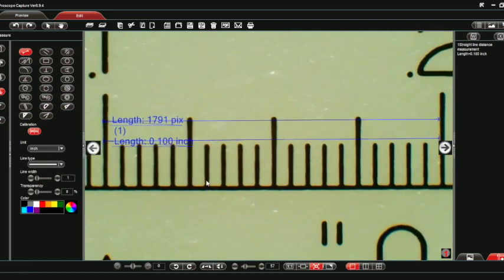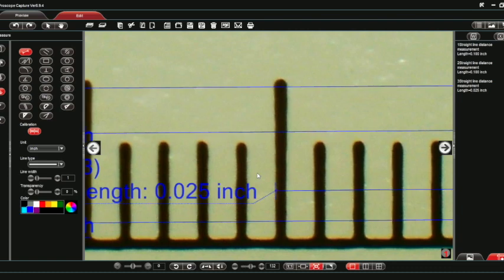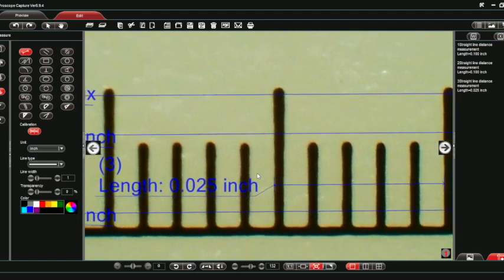If you want to see the screen better, you can roll your mouse to zoom in on the image. Let's do that measurement again — click the left hash mark there and the left hash mark here. That again shows a hundred thousandths. For a smaller measurement, let's do twenty-five thousandths: click the left hash mark here and the left hash mark here, and that shows up as twenty-five thousandths of an inch. You can zoom in or out as far as you want.